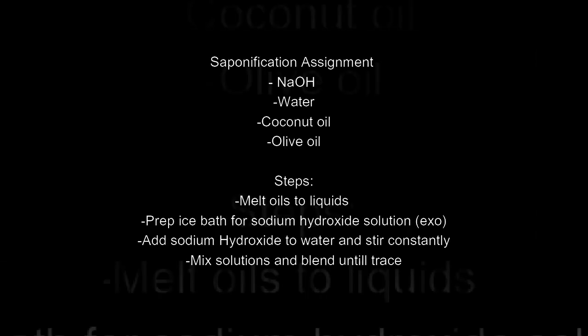Saponification by Ella Hilbrecht. So we're going to be reacting sodium hydroxide with water and then that with coconut and olive oil. I'll be walking you through the steps this takes.